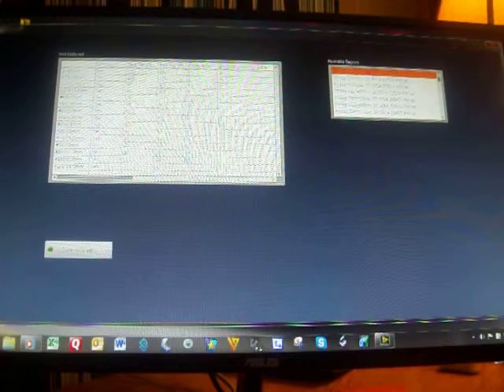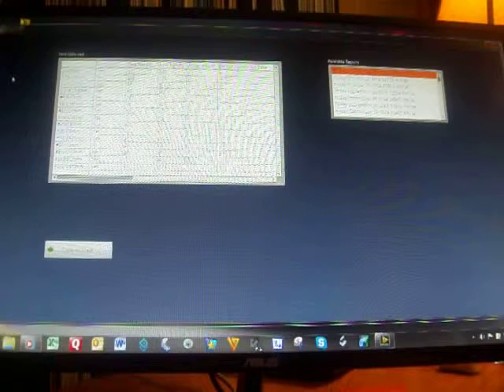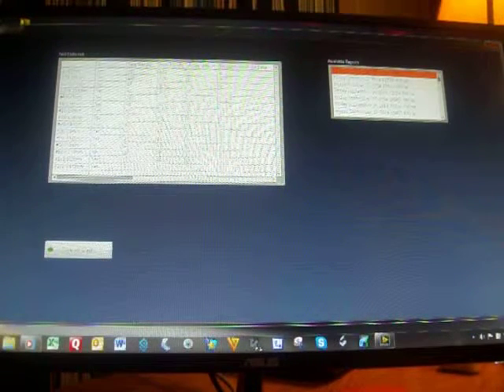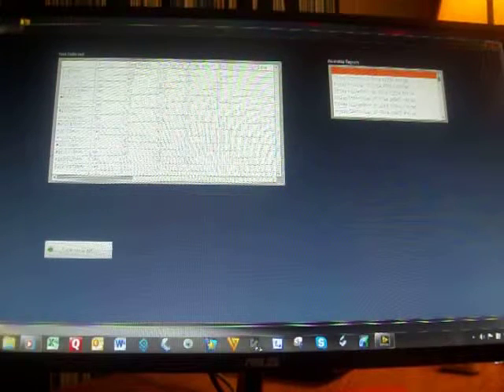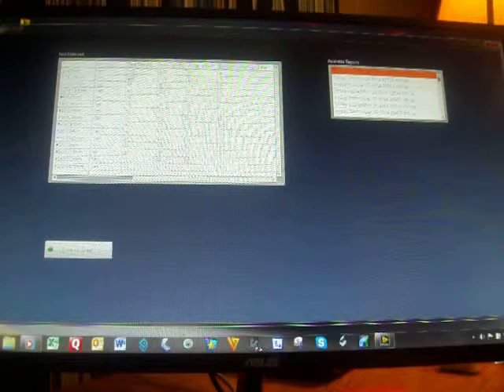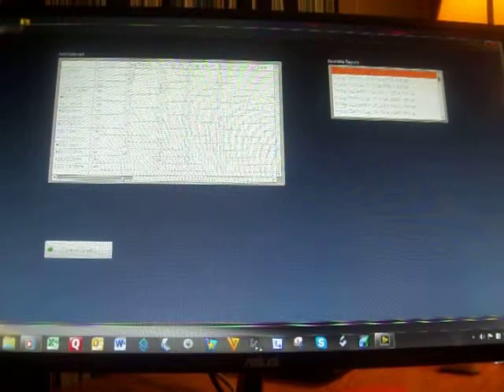Okay, the test sequence is completed. This is just a quick visual of the results. In this first column, next to each of the sieves, it tells you if it was selected or not. If you recall, we selected all of them. And it shows the intermediate weights, the tare, the net, and the final weights.